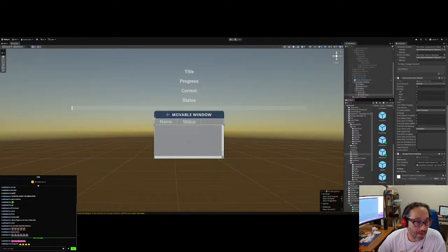And then we load it. Here we have a method that loads. Remember, we're using UniTask for everything because it's a lot more efficient than coroutines.